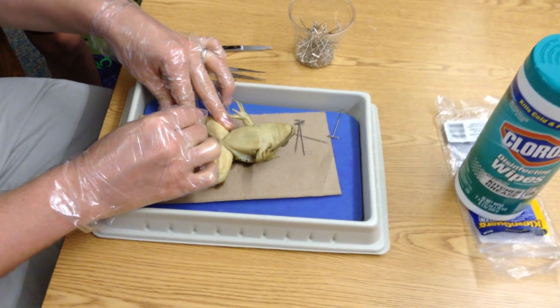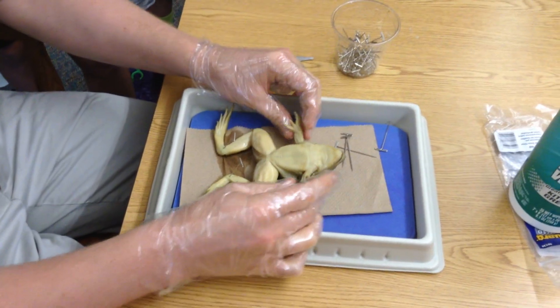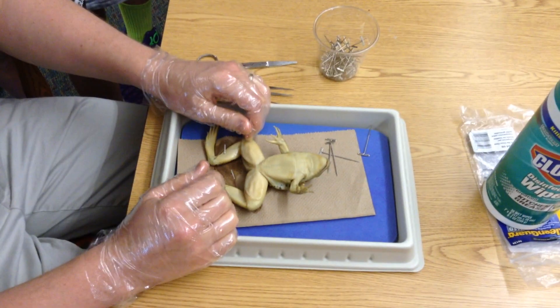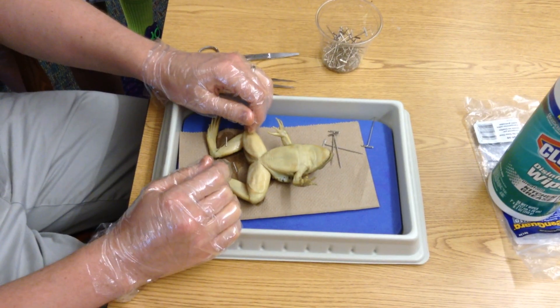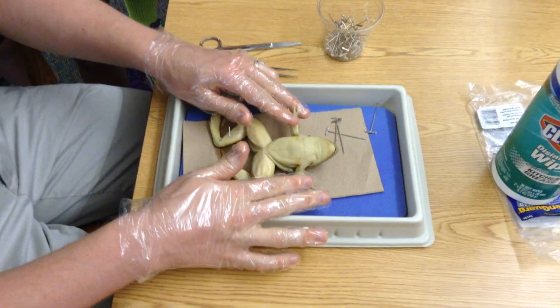Sometimes you actually hit the bone, like right there — it takes a little bit to click it through. Then the tough part is these arms; they tend to get in the way. I need to get them out of the way, and to do that I'm going to do something very special. What's the best way to get these arms out of the way besides pinning them back? Because when I pin them back, they just go like that. So what am I going to have to do first?